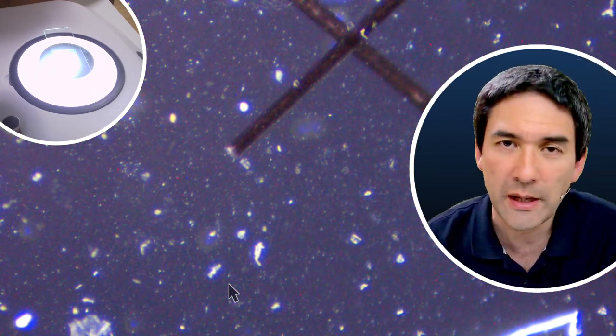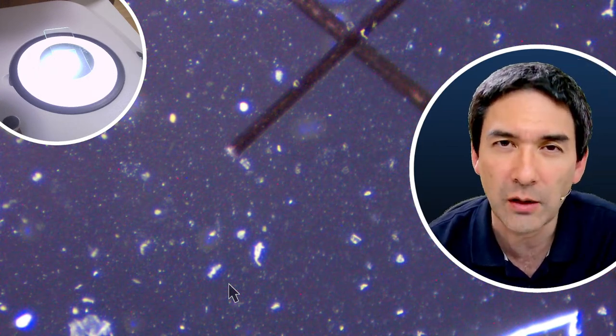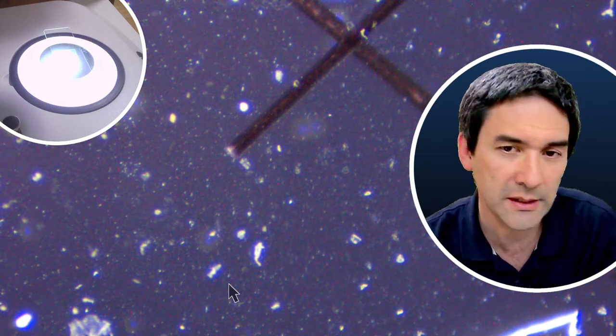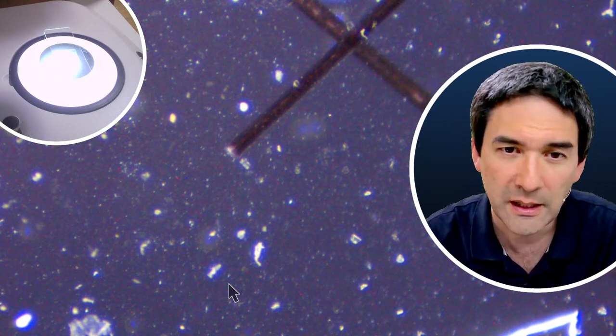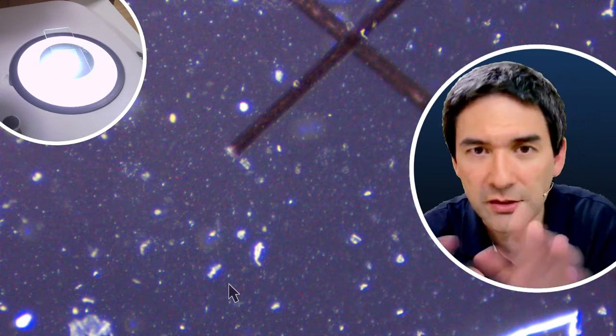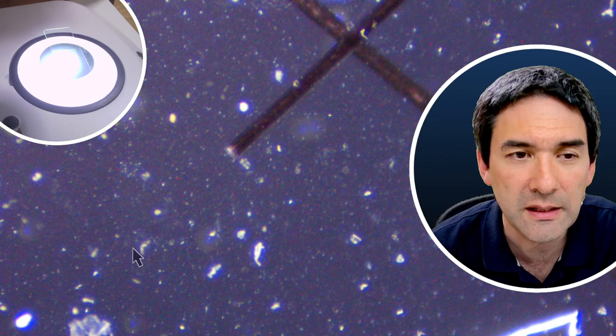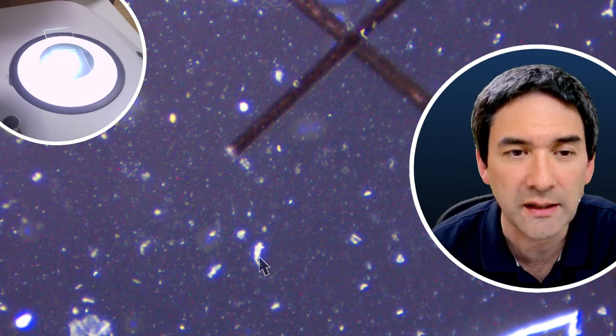What you have is, as a matter of fact, I think this is how chirality was actually discovered some time ago: if you use polarized light, and I'll give an example. Let's just use this one here in the back. You see all of those white dots, the dust and the dirt, simply depolarizes the light. The polarized light strikes the dust, and it becomes depolarized, and it goes out in all different directions again, and that's why we're able to see it.